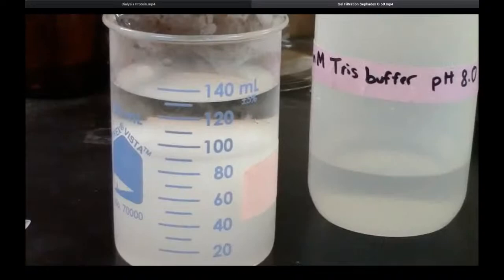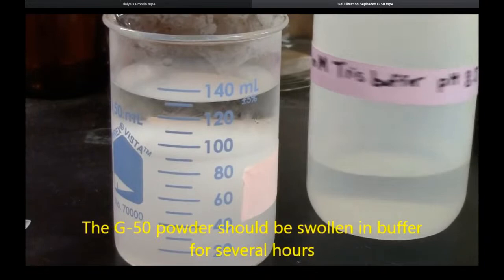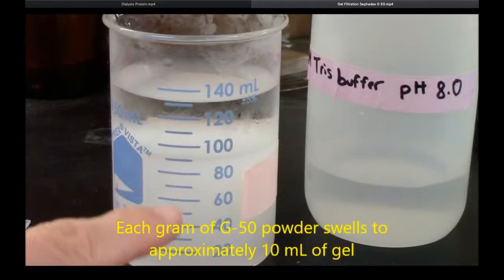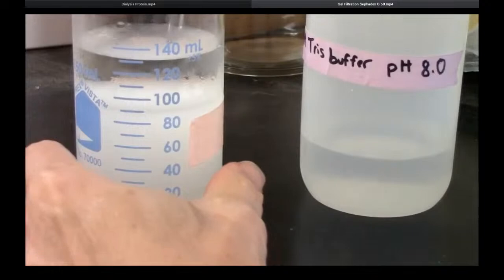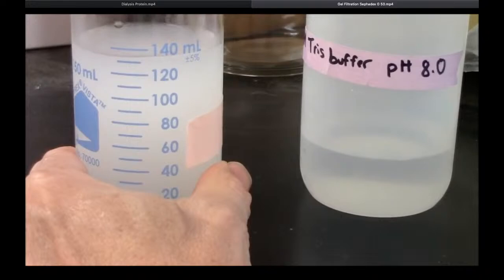In this beaker, I put 9 grams of the G50 powder, and I swelled the powder overnight using this Tris buffer, 30 millimolar Tris buffer, pH 8.0. You can see that the 9 grams has swollen up to a volume of about 90 milliliters, almost 10 milliliters per gram of solid. Now I'm going to gently stir the gel. It's important not to stir this too vigorously. Don't mechanically stir this. That can break your gel particles up into very fine dust, which will impede your flow rate in the column.